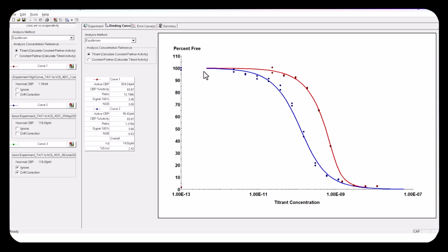review the results. And when I look at this data, something jumps out at me immediately. I'm pretty picky about my data fit, and I expect my model to fit the data very well, and that any residual error between the best fit theory and the data to be random. And when I look at this low curve here, and I imagine an average of these two data points, I see this one's low, this one's low, this one's low, this one's high, high, high, high, low, low, and high. And that, to me, does not look random.